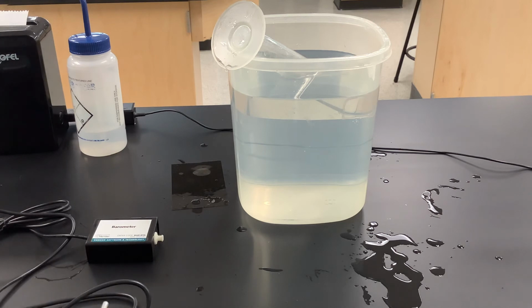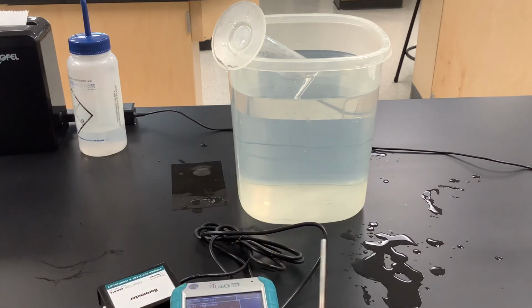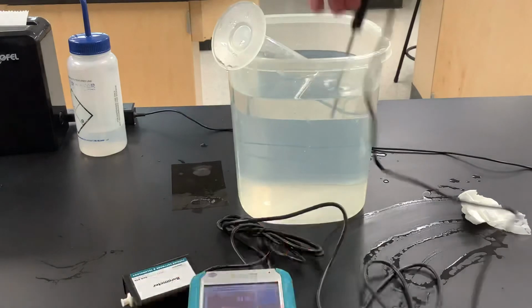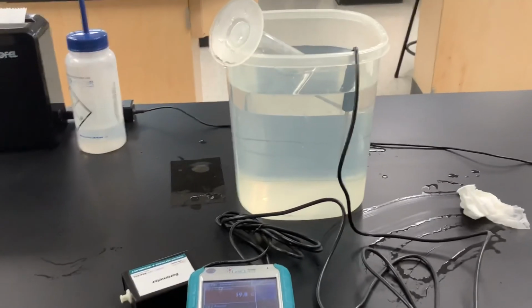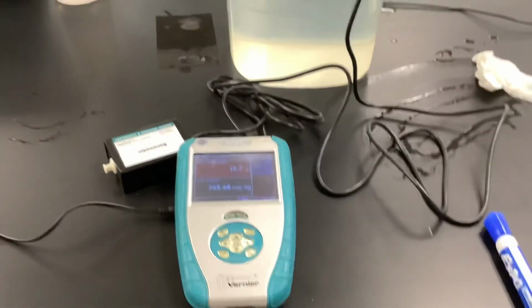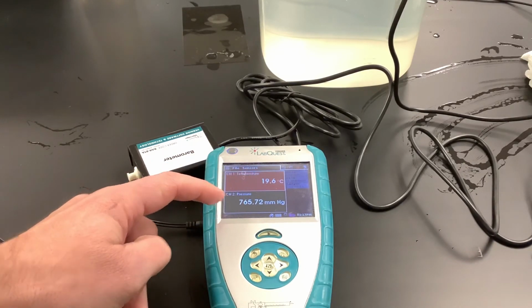One, we need to take today's air pressure, and so we'll be using the barometer for that. So I have the instrument here. I don't want to put it in the water, so we'll do our best to clean some of this up. And I'm also going to get the temperature of the water itself. So we'll go ahead and throw that probe in there. We're going to take a quick look at today's air pressure, and we're going to get the temperature recorded as well. So we should see both of those pretty clearly. We have our temperature up on top, and we have today's air pressure.